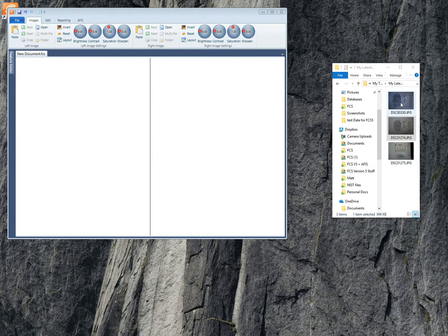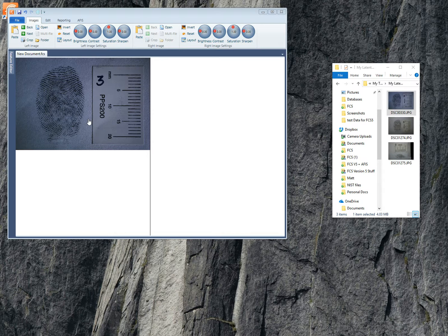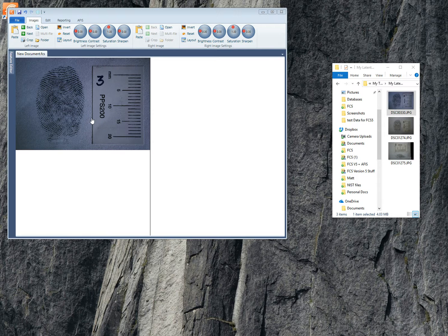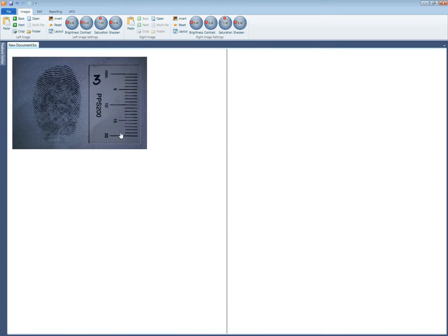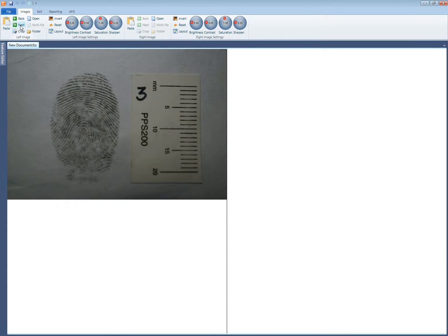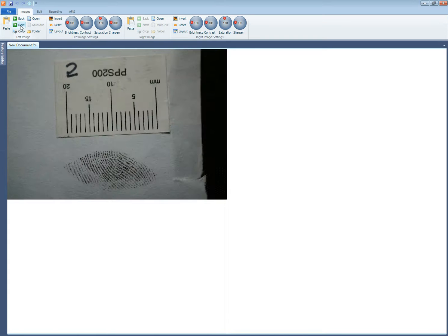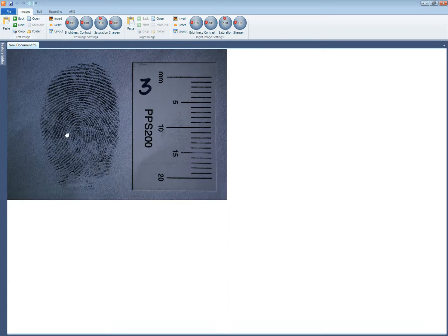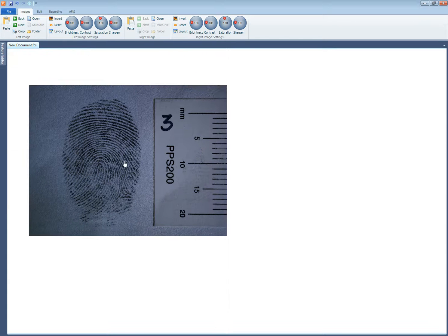I'll just select one and drag it across into the left screen and you can see there that it's a pretty good latent but I'll just check to see if the other latents that we have available are better. And no they're not. Now this is the best latent in that particular folder.